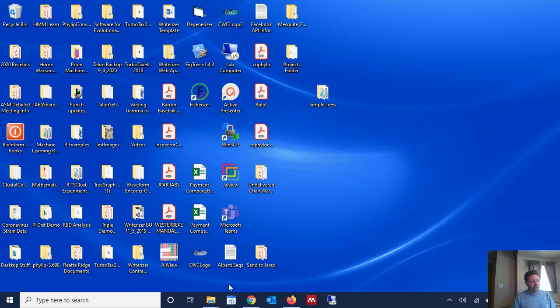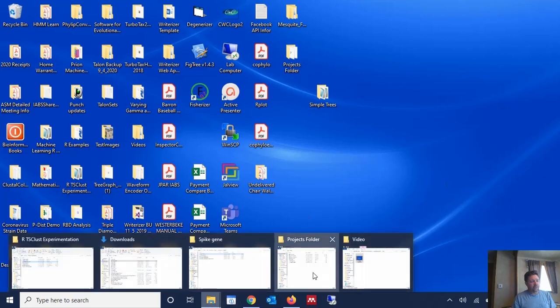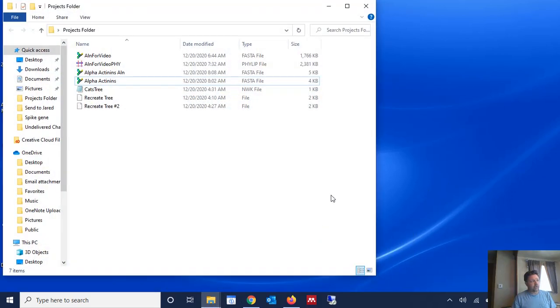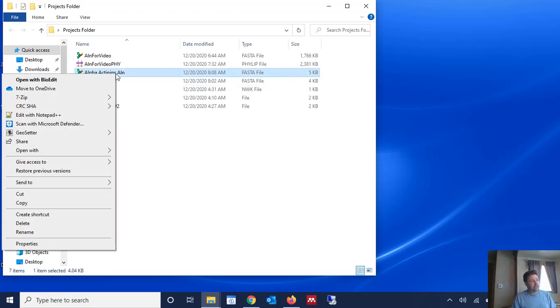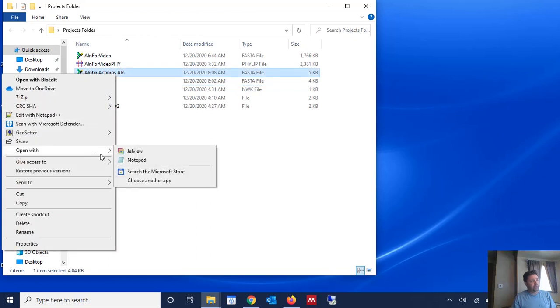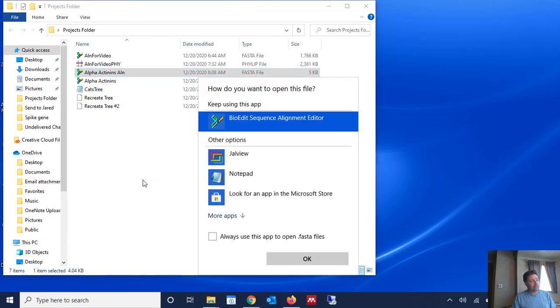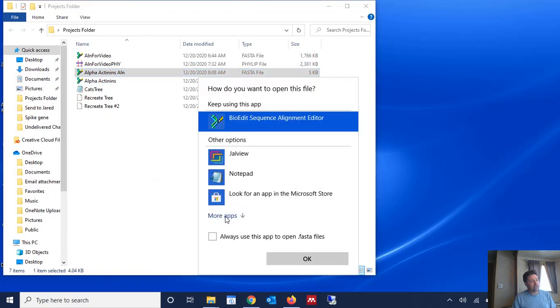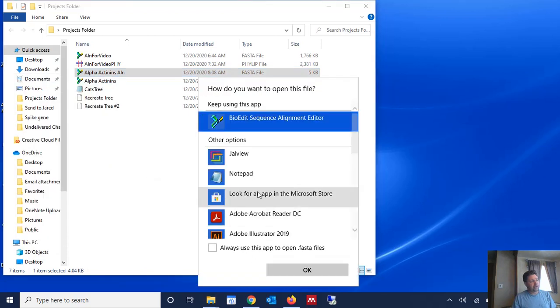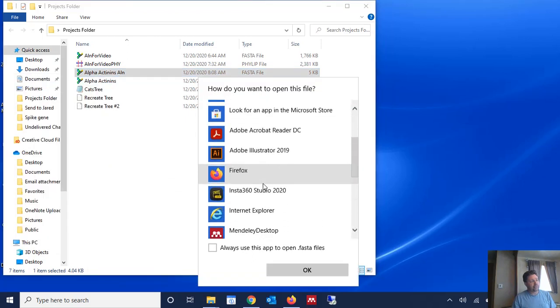So we already have the alignment and we're going to go to wherever we have stored the alignment and we're going to open it in BioEdit. So in my case I'm going to right click on it, open with, choose another app, and then I'm going to choose BioEdit.